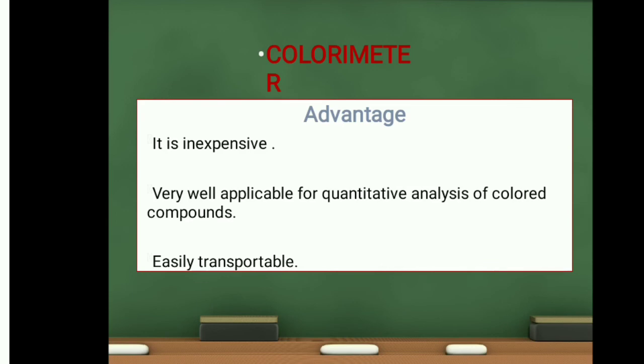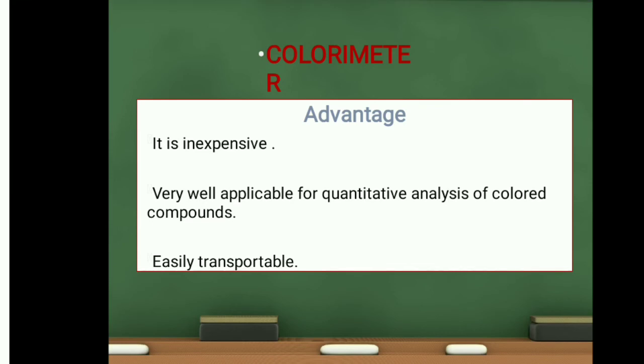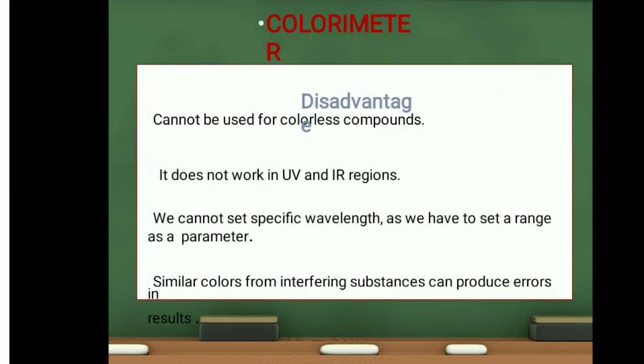Advantages of colorimeter. It is inexpensive, very well applicable for quantitative analysis of colored compounds, easily transportable. Disadvantages of colorimeter.